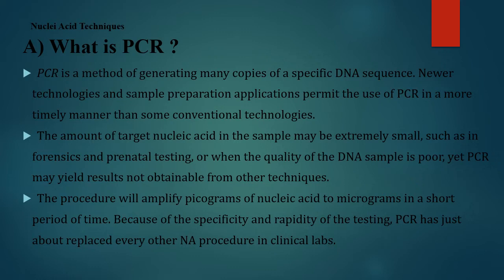Now, the amount of target nucleic acid in the sample may be extremely small. We're still talking about the use of PCR, such as in forensics and prenatal testing, or when the quality of the DNA sample is poor. Yet, PCR may yield results not obtainable from other techniques.